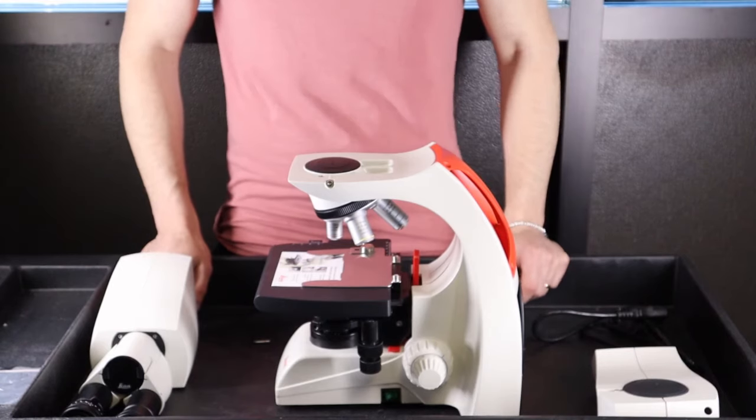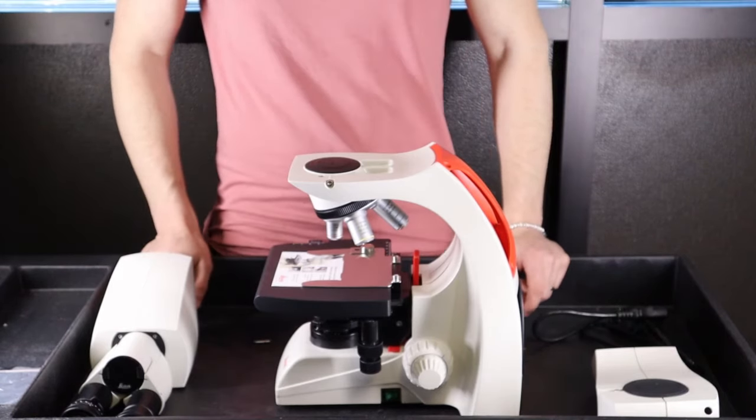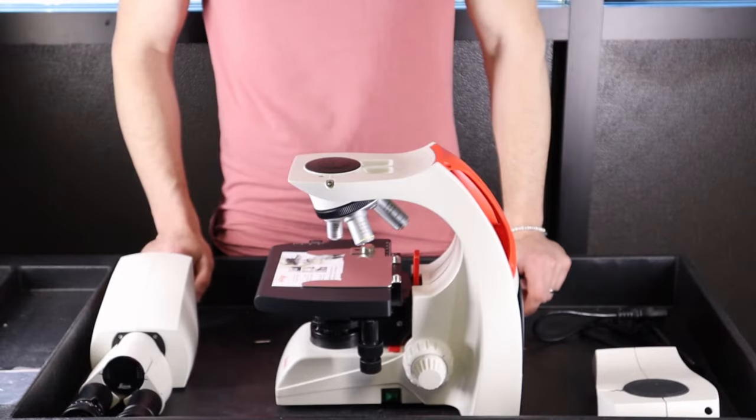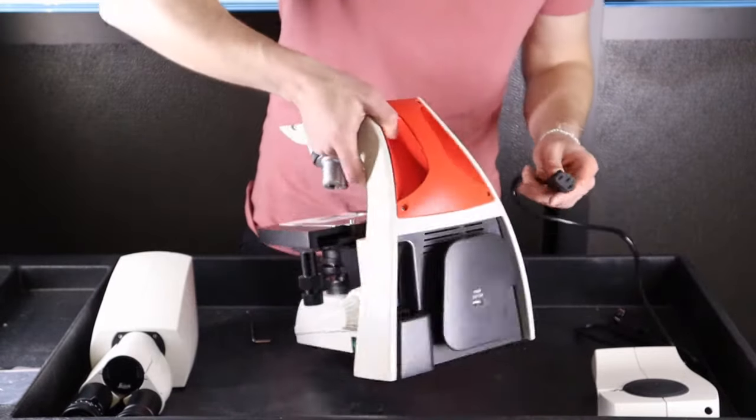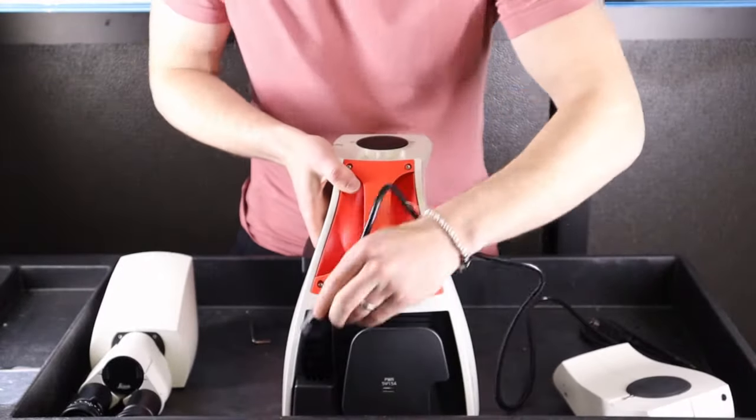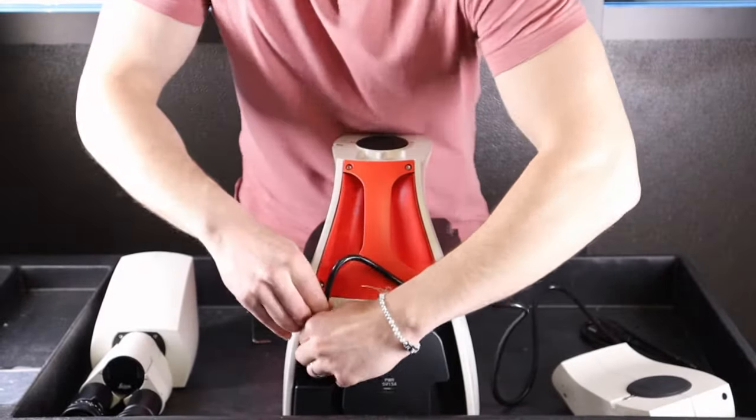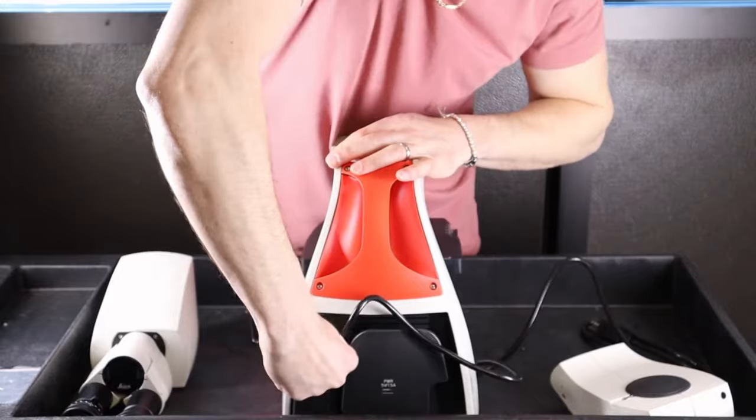This video shows how to assemble your Leica DM750 with your ICC50W camera system. The first step is plugging your microscope in. Take your power cable and push it down into the receptacle.